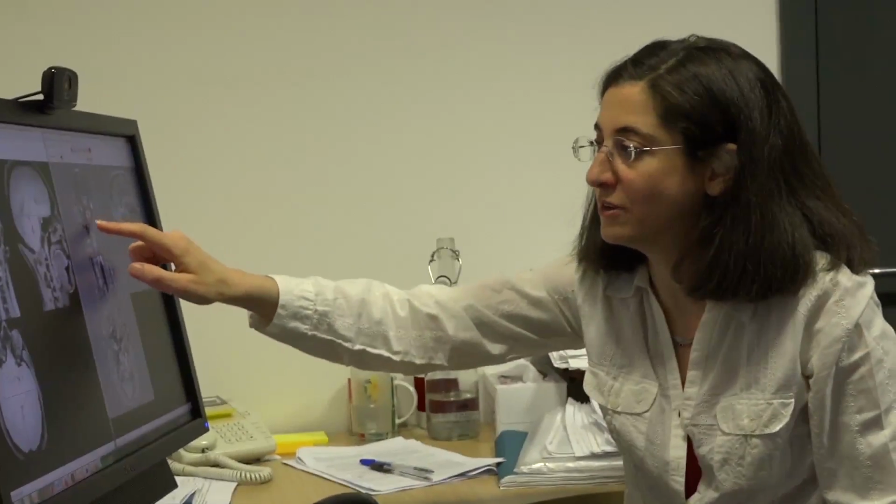And we need a technique to validate these methods and make sure that the values they give us are the true values, but we don't have a non-invasive way of doing that, and that's where the tumoroids come in. So as Umber will explain, these tumoroids are 3D cellular models that mimic realistic tumours and give realistic oxygenation levels just like the ones you would find in vivo in a patient.